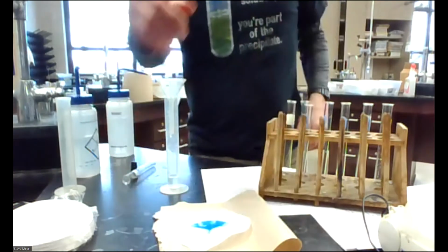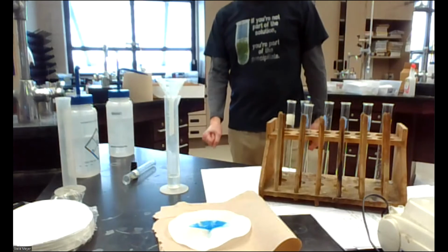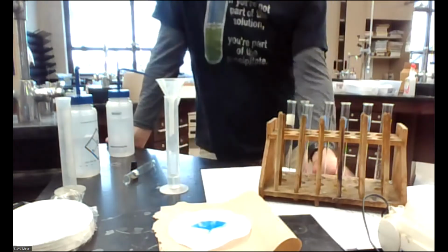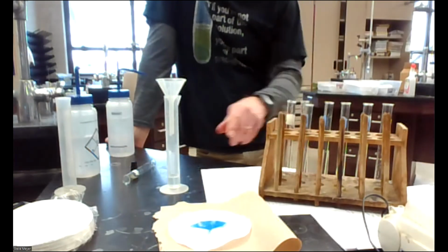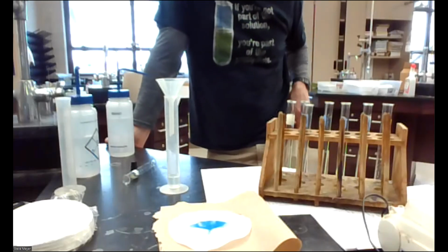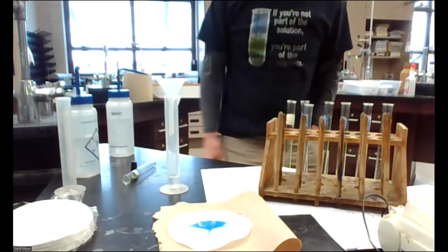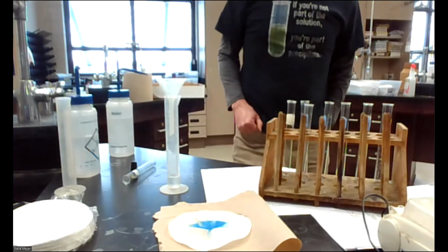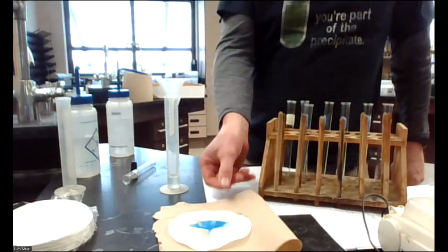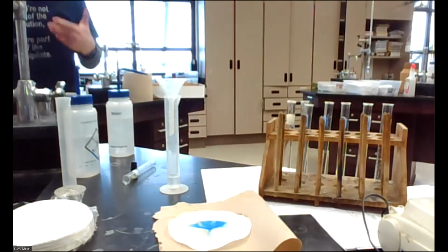Don't worry if you didn't weigh the filter paper today. It's pretty uniform, that weight. You can just weigh an empty filter paper. They're pretty standard. And then subtract out the weight of the filter paper from this time to next time. And ultimately, when it's all dry, you can get the mass. But it's pretty wet, and it's probably going to take 48 hours to do that, but it'll certainly dry over break. So that is an example of a product that we have for this lab and doing that step 2.